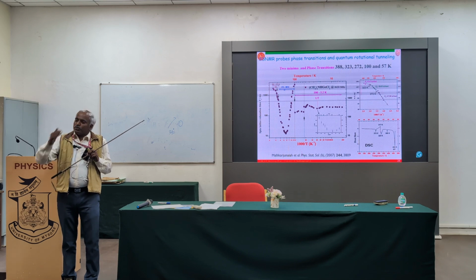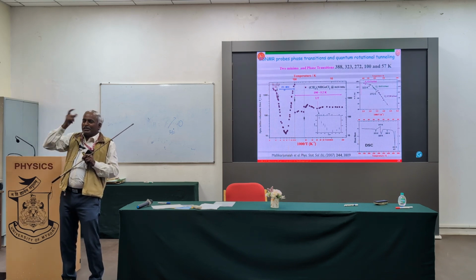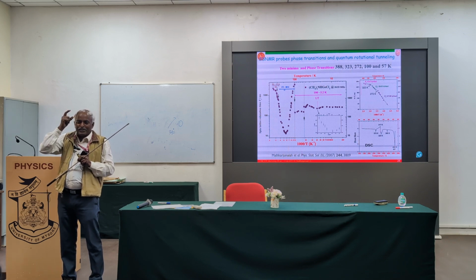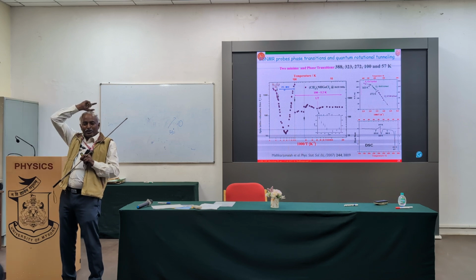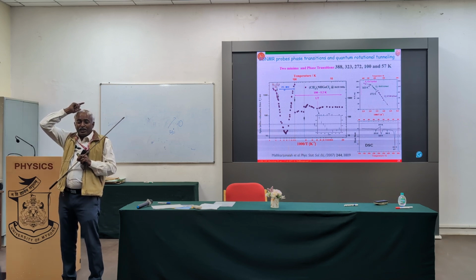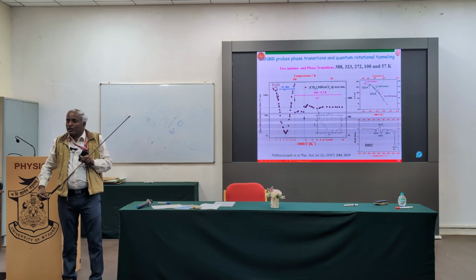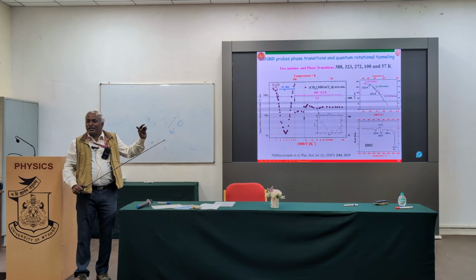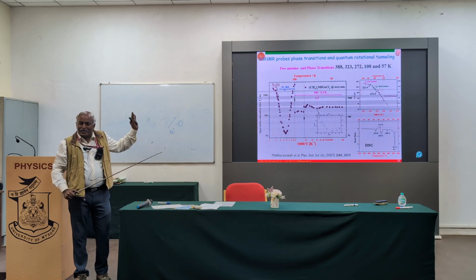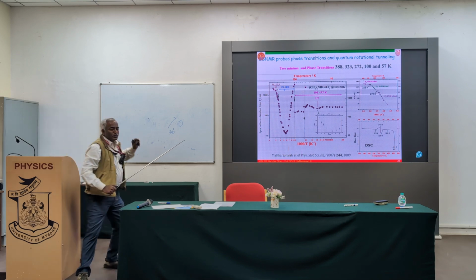That's why after taking 5 readings, again we go back to the first reading, to check whether, if I change one of the parameters, I get back the first reading properly or not. Again I take another 5 readings, and again I go back to the first reading, to check whether anything got changed or not. Like that, we have tested repeatability several times. That's why many people don't, they just send the sample. That is why I said this SSLMR is an independent technique. Okay, that has been taken care of.